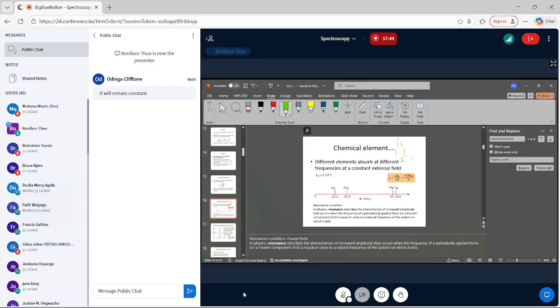That is why we actually use the chemical shift, because if you look at the absolute values of frequency, then it depends on the strength of the magnetic field. But when you convert to chemical shift, that difference is not observed. However, a stronger magnetic field allows you to tell apart two frequencies which are too close. Does that answer your question, Julius? Yes, yes, yes. Thank you.